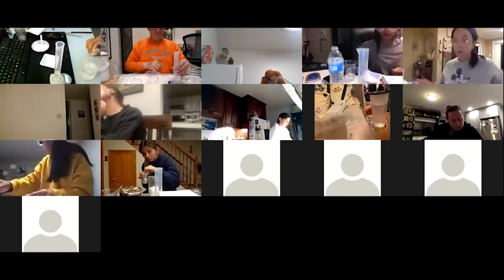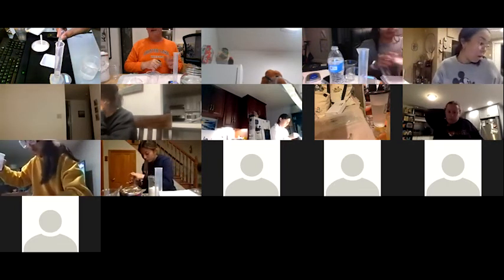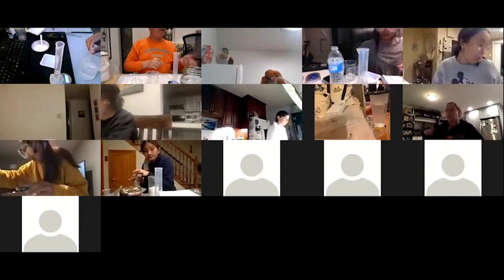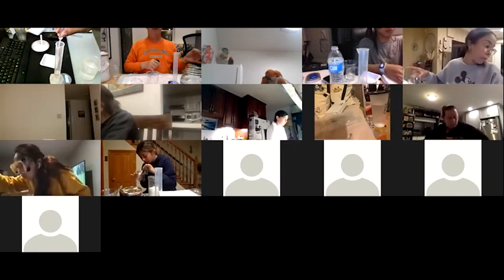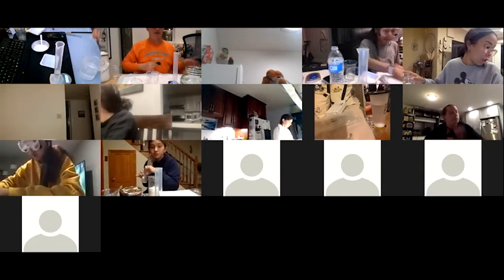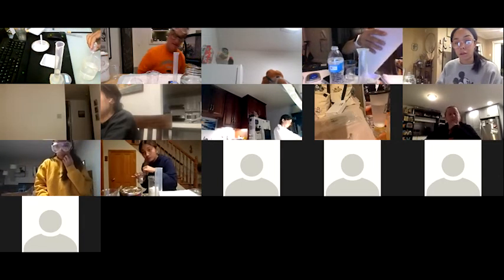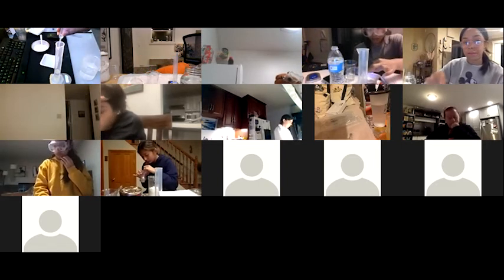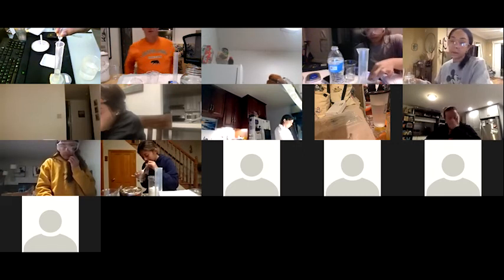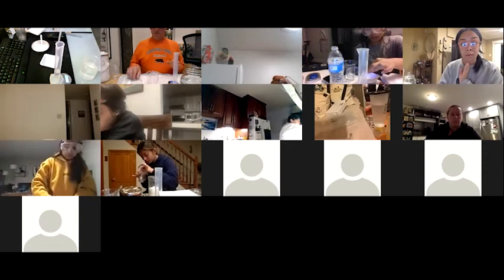Does it have to be exactly 50.00 grams? You want it to be as close to 50.0 as you can. Obviously you can't get exactly 50.00. I got like 50.03 or something. That's close enough. We're not trying to split the atom here, so we're not going to worry about 4 degrees of precision. Okay, because I got 50.04 for the 70% for one of the cups. Okay, perfect.